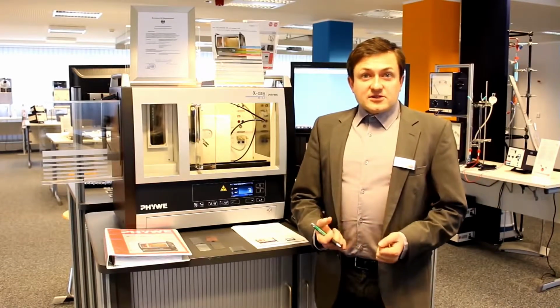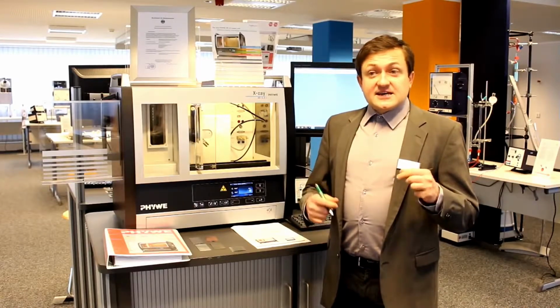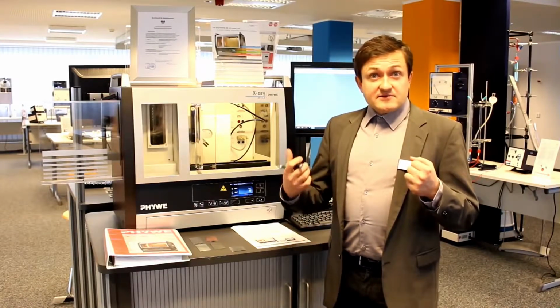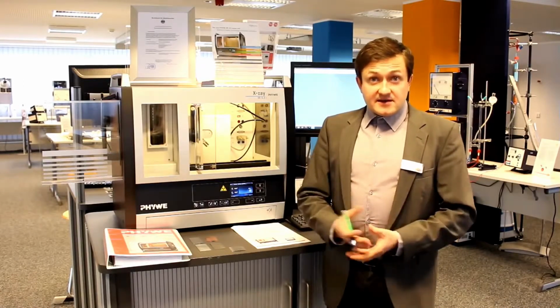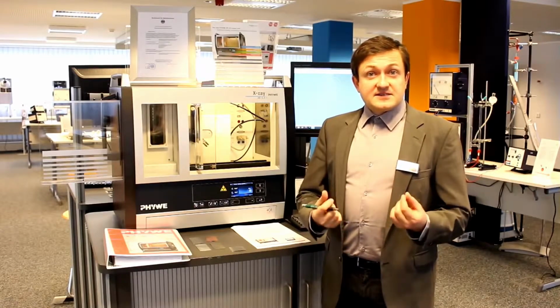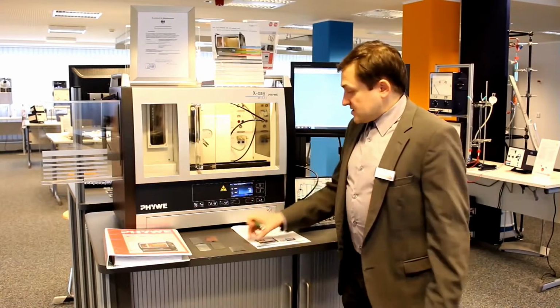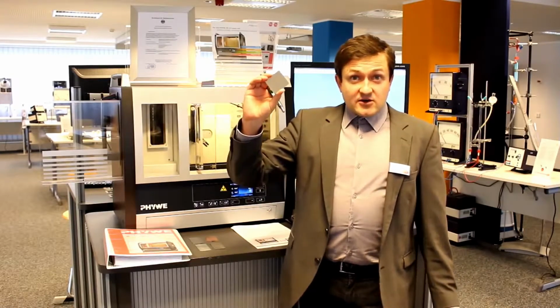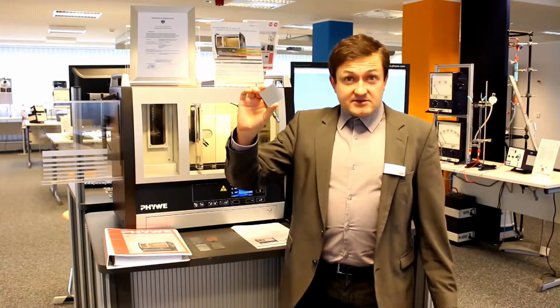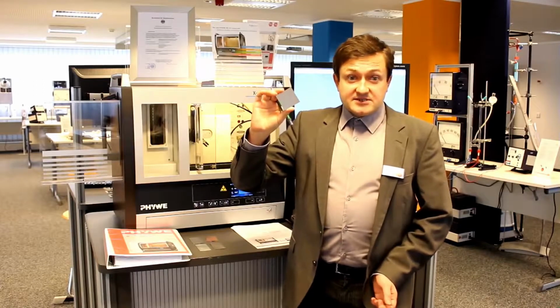First, a couple of words about X-ray fluorescence. You don't see this fluorescence, but anyway, it's a process of the emission of secondary photons from atomic material. And this is a very powerful method to conduct elemental analysis of materials. Our exercise today will be to find out the chemical components of the material called constantan, which is a magic material of physicists because it keeps the same electrical conductivity independent of the outside temperature.